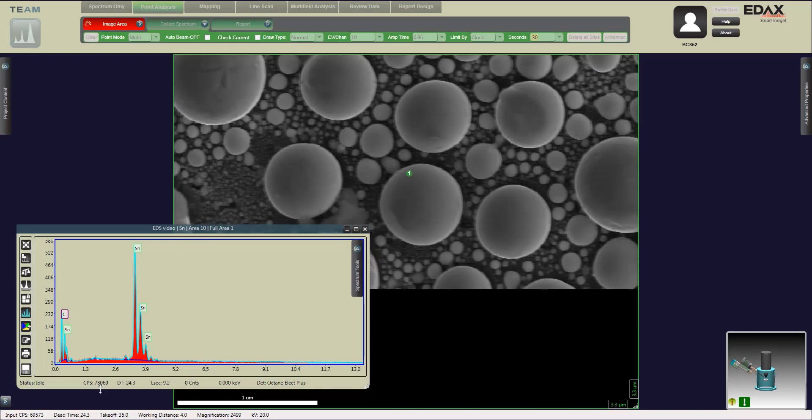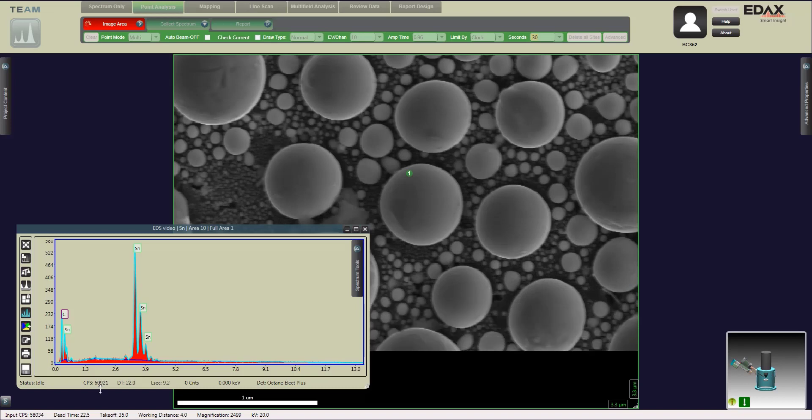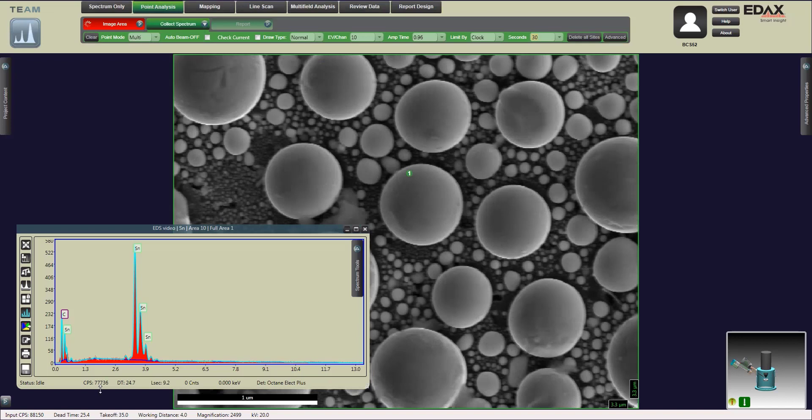With the sample, the bright spots we see, the strips we see are the tin. Some of the darker areas is going to be carbon. When it hits the carbon, it's going to drop a little bit lower. When it hits the tin, it's going to increase.